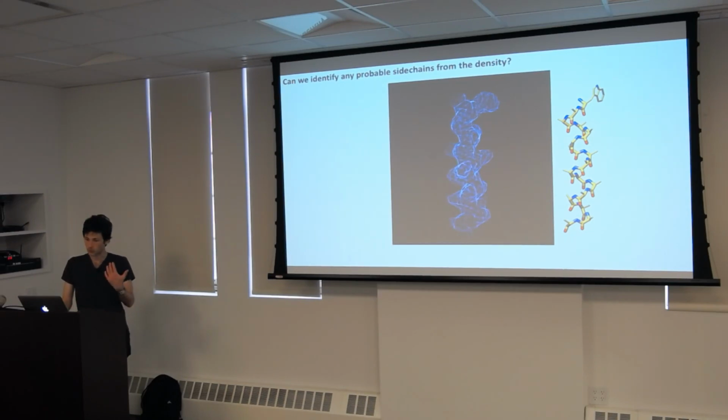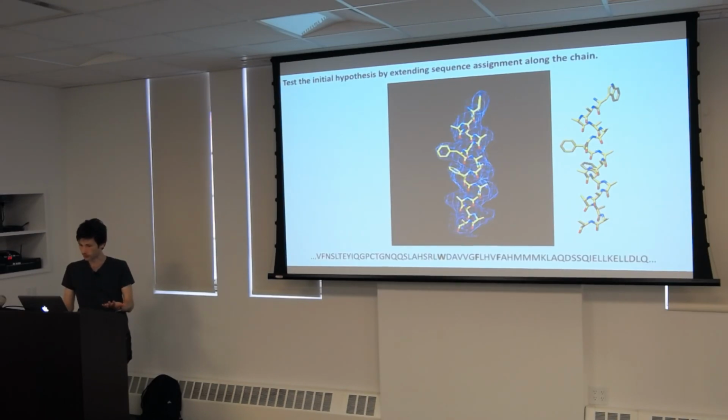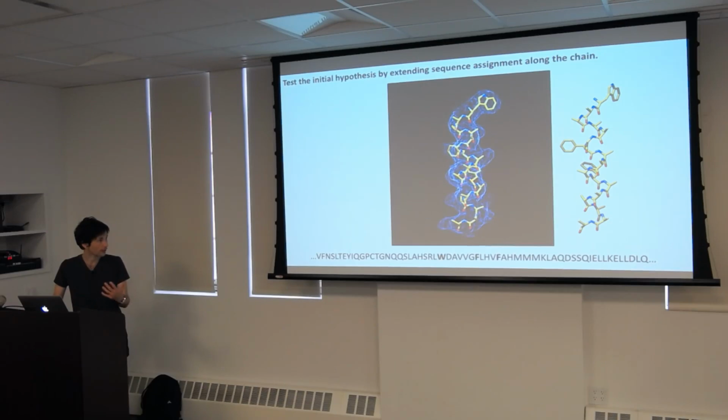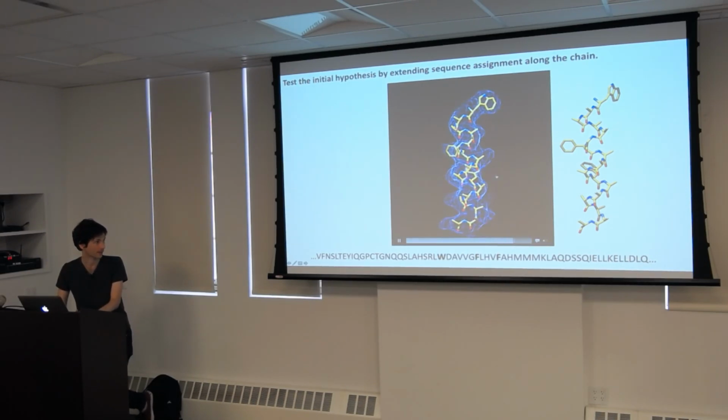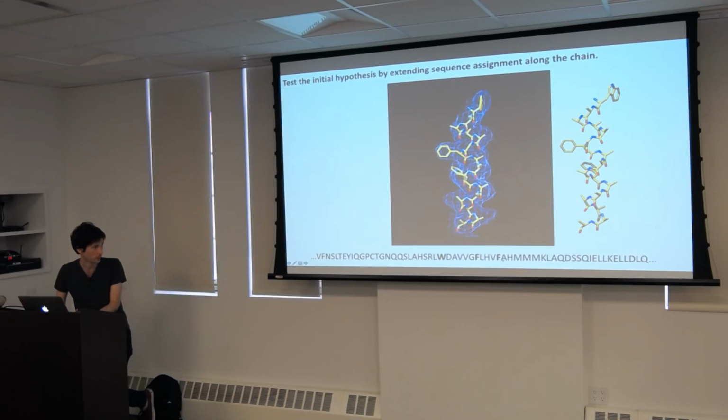Let's say it is a tryptophan, and there's the actual atomic model in the map. What we have is tryptophan there, and the other one, as it turns out, was a phenylalanine, notionally at least. We make the hypothesis that this one's a tryptophan, this one's a phenylalanine, this one's a phenylalanine, and that this corresponds to this region in that sequence.